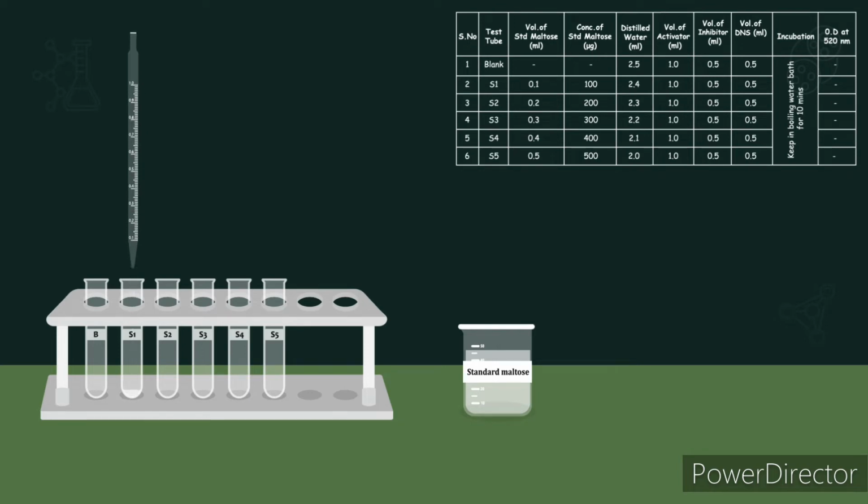You can look at the tabular column, the volume of the standard solution from 0.1 ml to 0.5 ml.